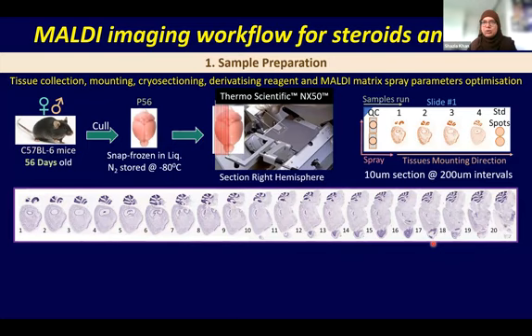And there are other challenges: apart from biological variability, there is technical variability due to sample preparation of different slides and quality, which causes batch effects and other technical variability, and requires robust quality control and quality assurance measures for reproducible and reliable results.